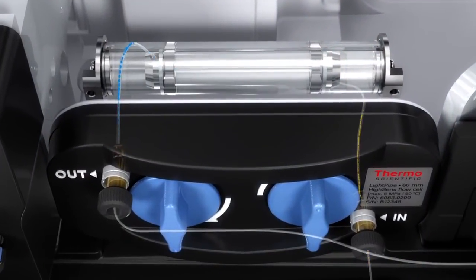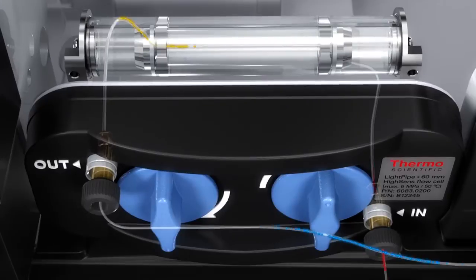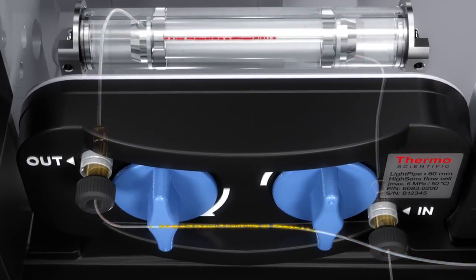And we come a long way here with a new diode array detector that has a light pipe technology flow cell up to 60mm long. So that really gives the extra sensitivity that our customers are looking for without compromising on dispersion and quality of data.